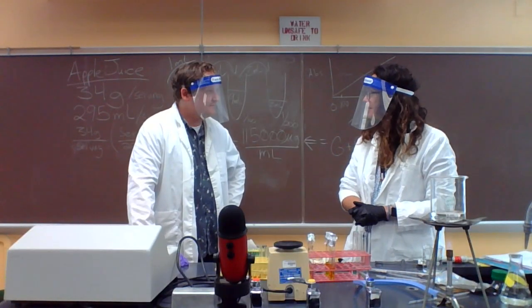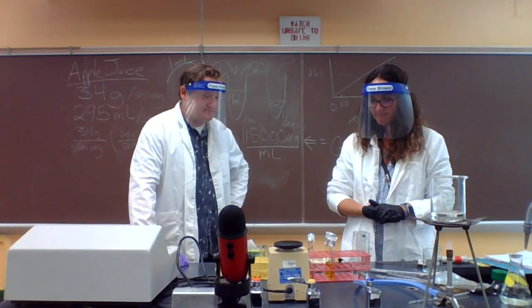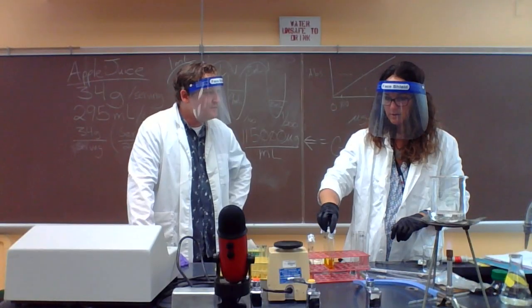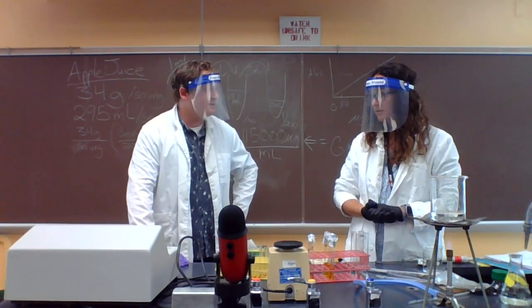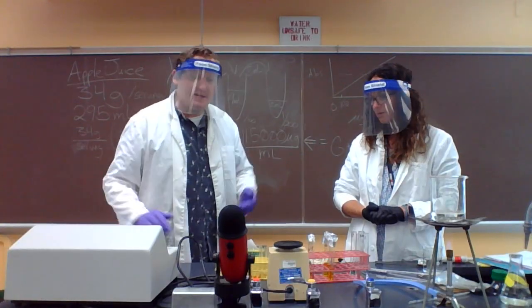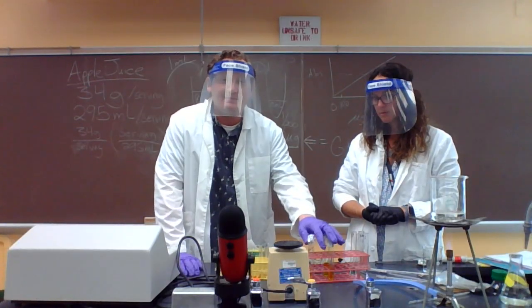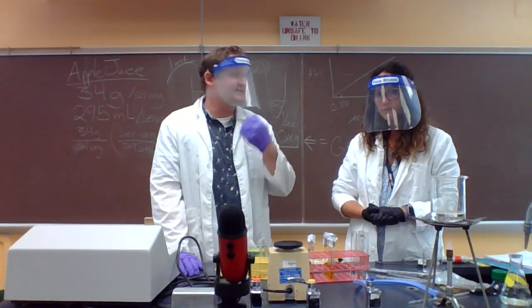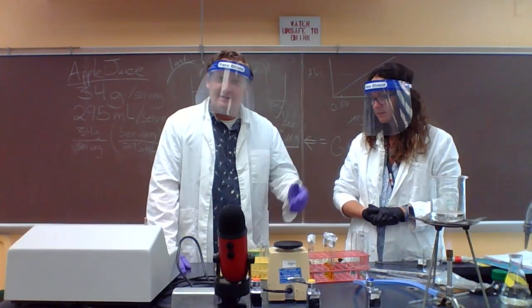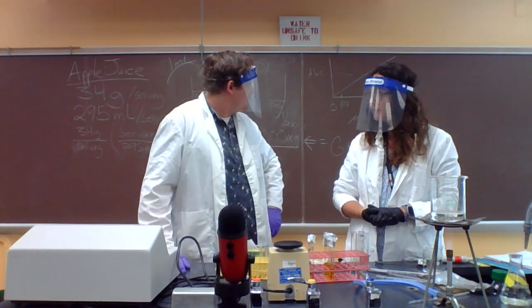So I think that's good. I think that's everything. What else will the students need to know? They've seen the running through of a spectrophotometer. So I think that at this point, we'll be boiling these samples. We'll be running them through the Spec 20 just like you saw in last week's lab. And unless you have any objections, this is a good place for us to end.